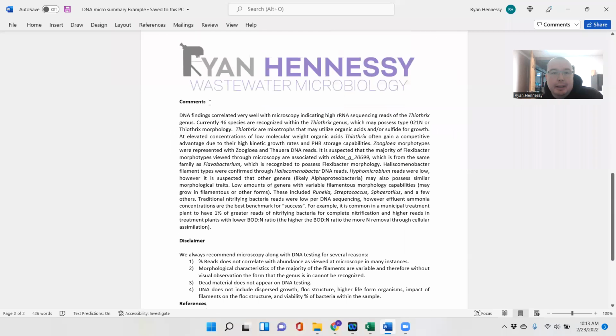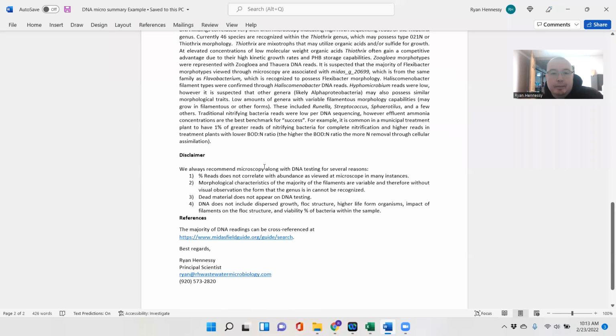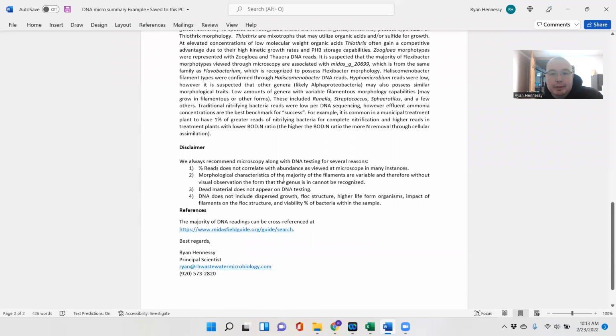Then I have a common summary of what I saw and what the correlations were. There's also a little disclaimer, as we talked about, and that's a separate topic as far as interpreting DNA reads and things along those lines.